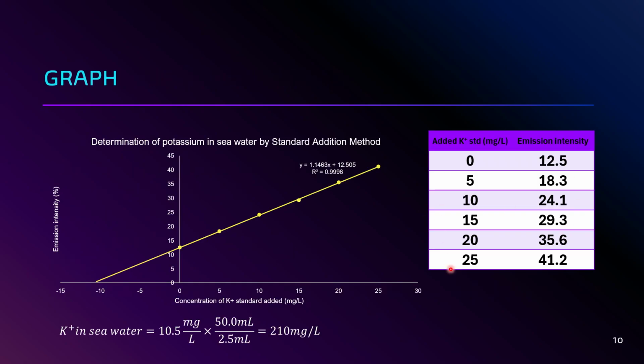This is the sample reading, or simply you say model reading. I have plotted these values and I have acquired this kind of graph. If you observe closely, this graph is giving you an intercept. So which means that in order to construct a good graph, you need to leave some space on the left side of your graph paper.